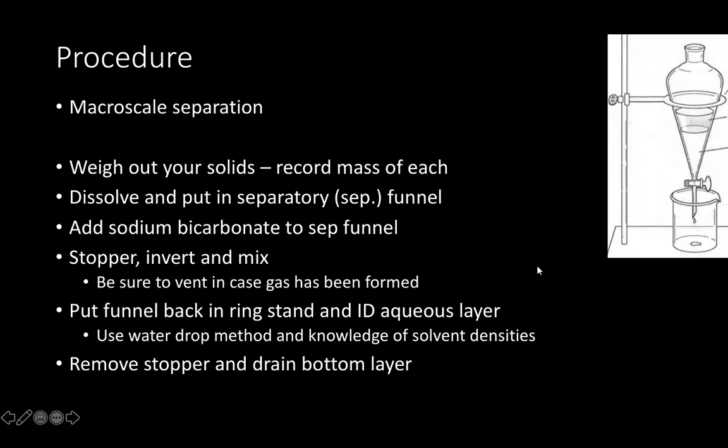The first thing you're going to do is weigh out your solids and record each mass — you'll be coming back to this at the end of the lab. After you have weighed out each of your solids, you'll mix them together and dissolve them in your ether and put that solution in a separatory funnel.